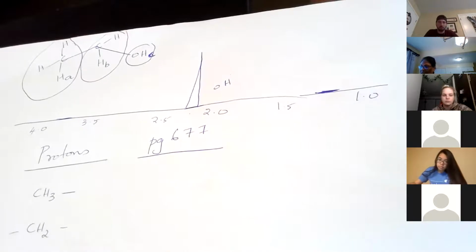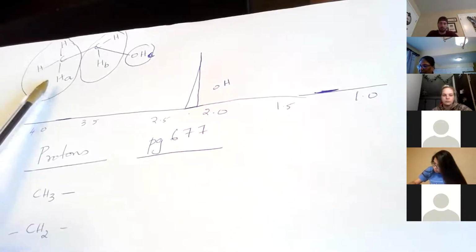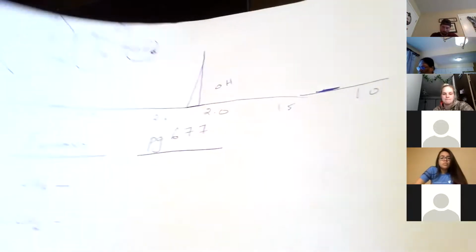Now, let's look at the CH3. The NMR table that I had will tell you where the CH3 appears. I'll pull it up a little bit later after Michaela's presentation. So the CH3 is going to appear at a certain range, and I've indicated the range here.